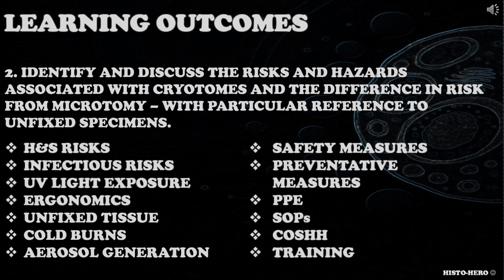Consider shared risks like sharps injury, repetitive strain injury, different risks like cold burns, biohazards, pathogen exposure, fire or explosion risk, safety measures, PPE, SOPs, COSHH, training and so on. Compare and contrast cryotomy and microtomy, fixed versus unfixed tissue, aerosolization, or disinfection difficulty.